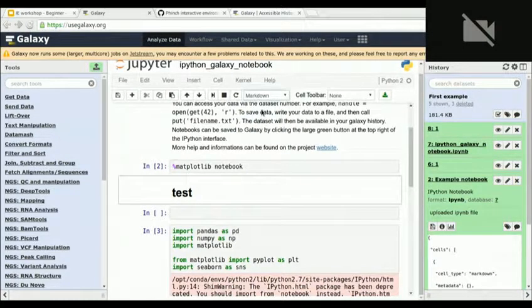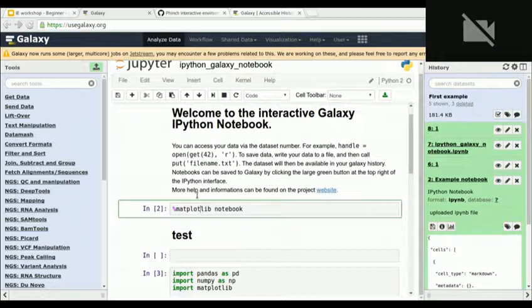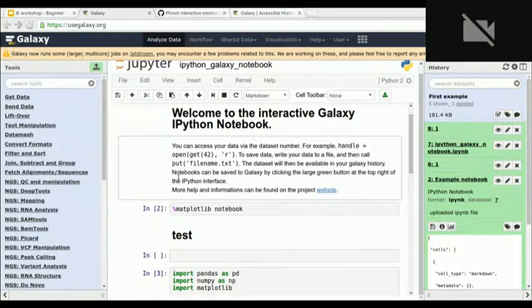So the question was, how do I change from a code cell to an HTML cell so that it's rendered, so that I can annotate stuff. So maybe this is not clear. Every block, even this one here, is called a cell. It's just that it's rendered differently.